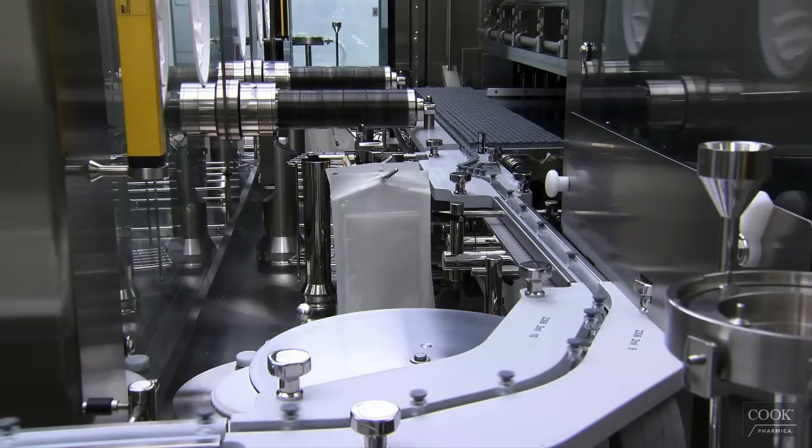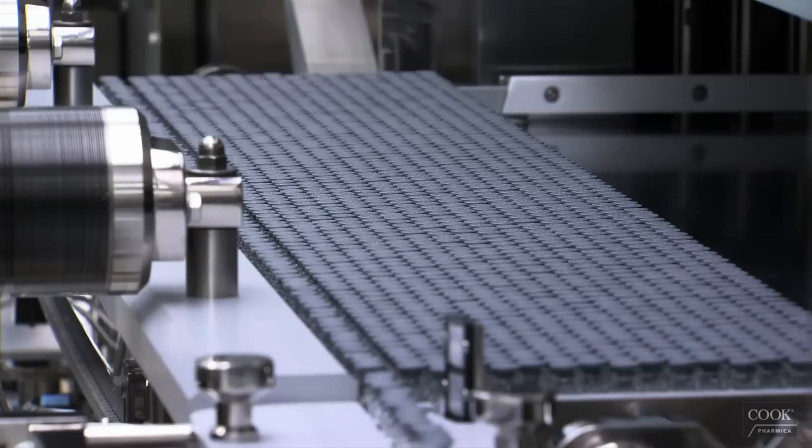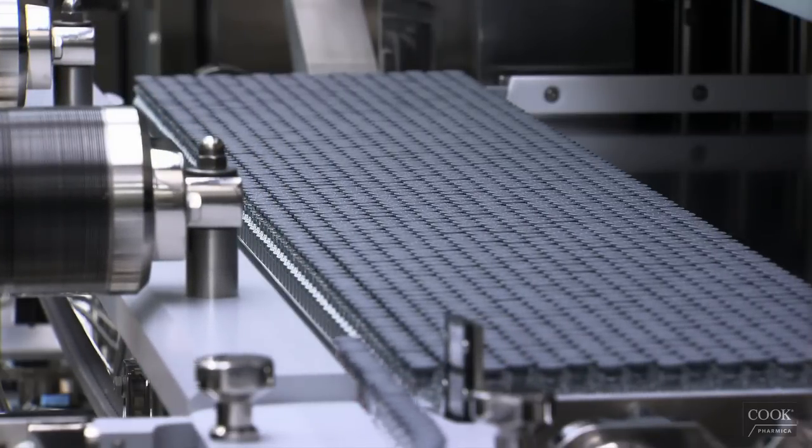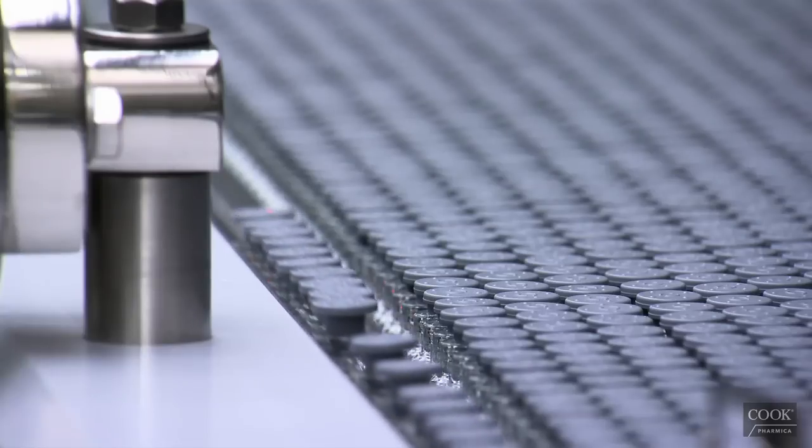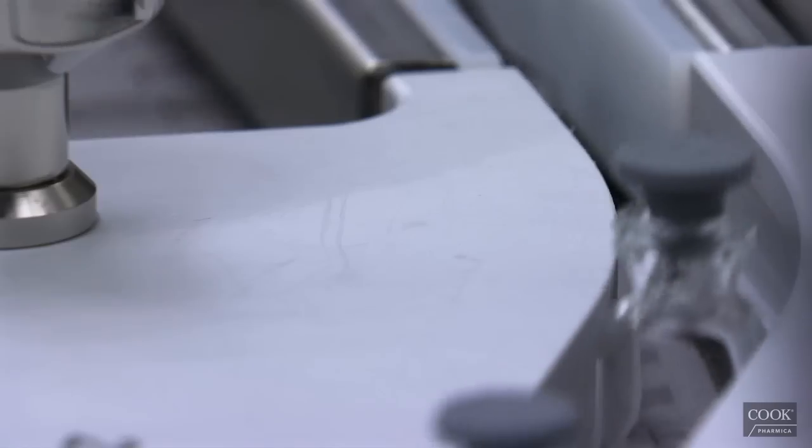For freeze-dried products, the vials enter the 250 square foot lyophilizer using an automated loading and unloading system that feeds vials row by row. The lyophilizer can hold 120,000 2-milliliter vials or approximately 30,000 20-milliliter vials.